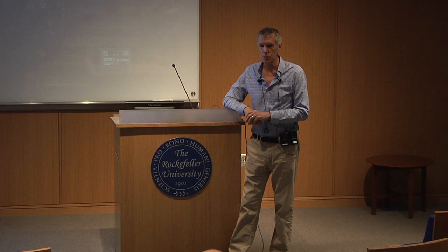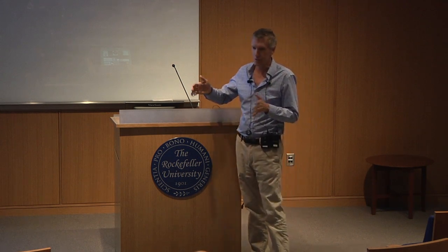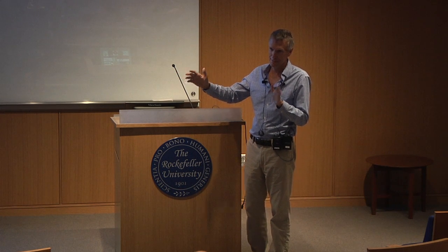Yes. I think most of us probably have more than 1% differences, even though we're using the exact same thing. So how do you deal with it when you go to GenBank? I'm sure people have made mistakes and the sequencing isn't perfect. When you then said, 1% or 2% is kind of the margin of error. So you're saying between your forward and reverse sequences, well, first of all, cut off the ends of the sequence, because that's usually where the trouble is.